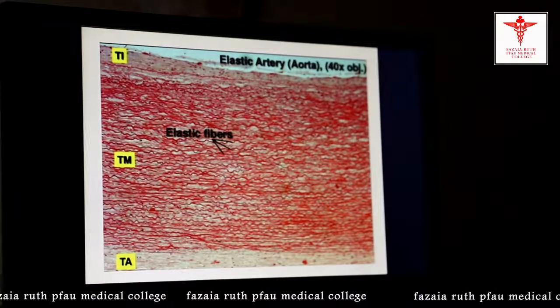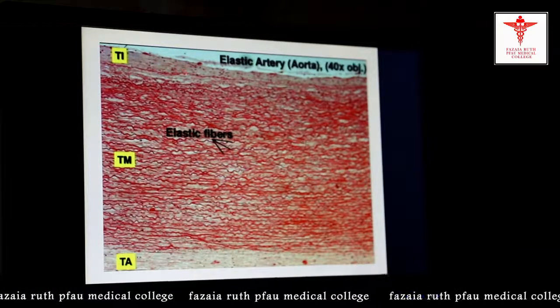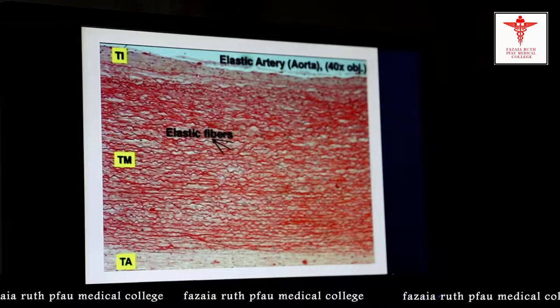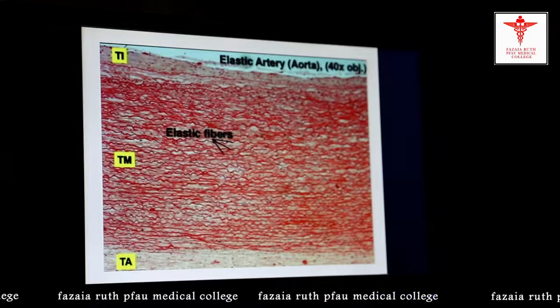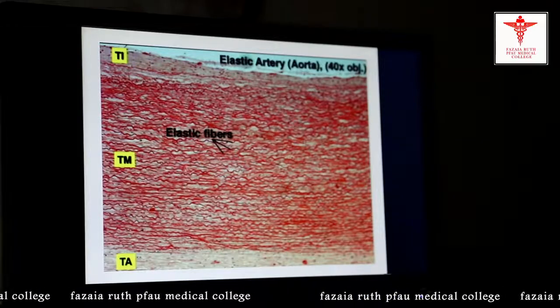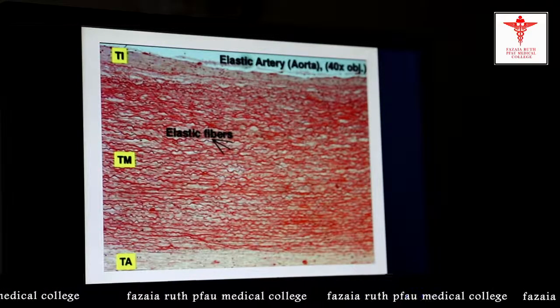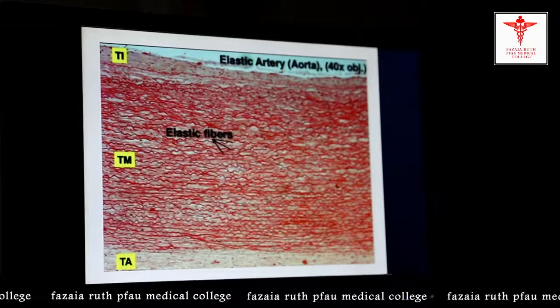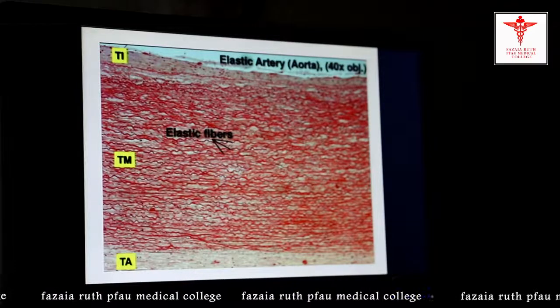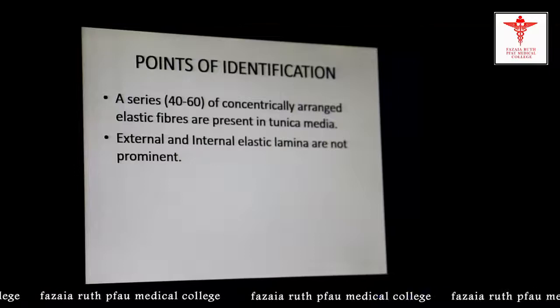This picture is taken from a slide of an elastic artery under the microscope. Starting from the first layer, this is the tunica intima, consisting of the endothelium and the sub-endothelial connective tissue layer — we cannot appreciate, or there is a very thin line of, the internal elastic lamina. The middle layer, tunica media, is quite thick and richly filled with elastic fibers, with smooth muscle fibers interspersed between them. The outer layer, tunica adventitia, is quite thin and has the vasa vasorum.